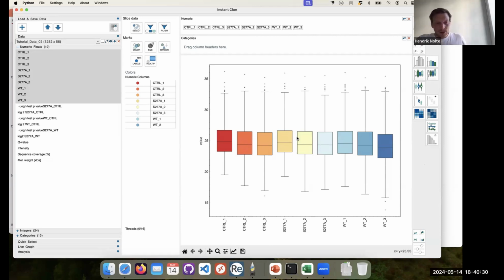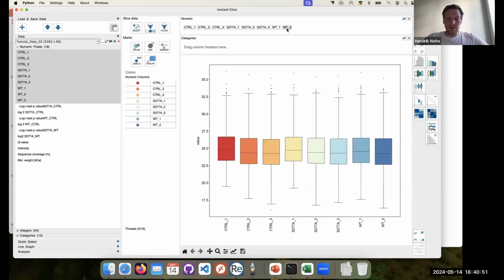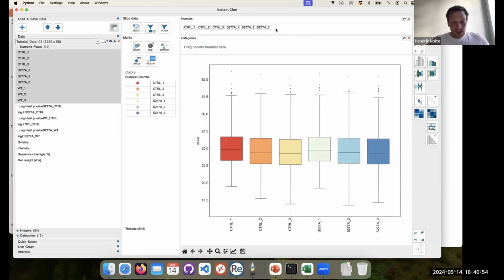Okay, so I was just introducing the software a bit, very generally, not to go too much into detail about the data. You can remove any column header that you have put here into the receiver box by just right-clicking on it, and it will just replot the same chart, just excluding the data. You have here the colors, and you can also identify the box plot by just left-clicking on the colors. It is true for almost everything that you can change the color here.